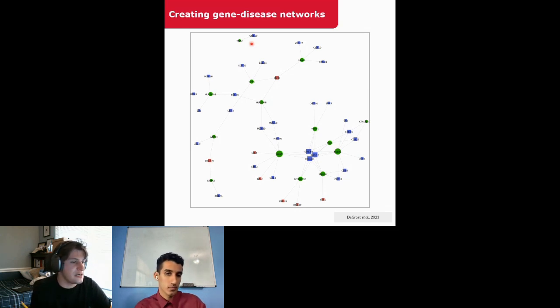Because IntelliGenes is a non-biased platform, meaning it is not reliant on previous annotation databases, it can be applied to any disease or condition. If you have data for a certain disease or condition you are interested in studying, you can use IntelliGenes without doing any prior literature search and generate a list of markers that we are confident are disease associated.